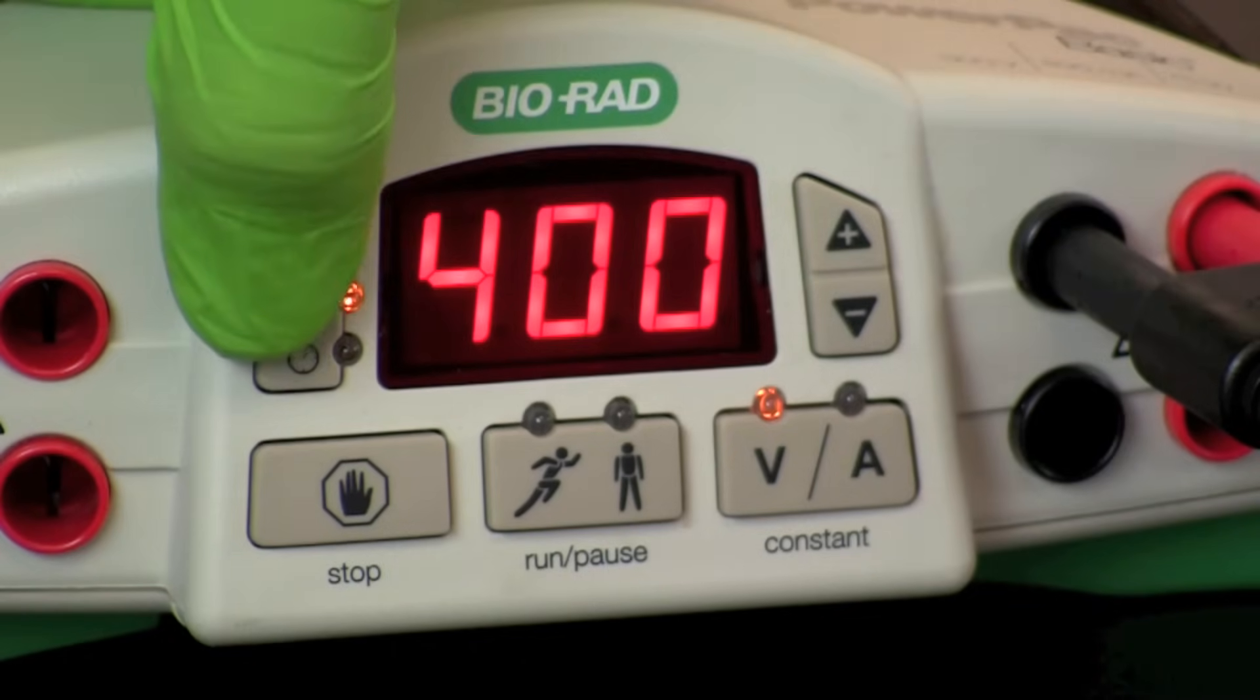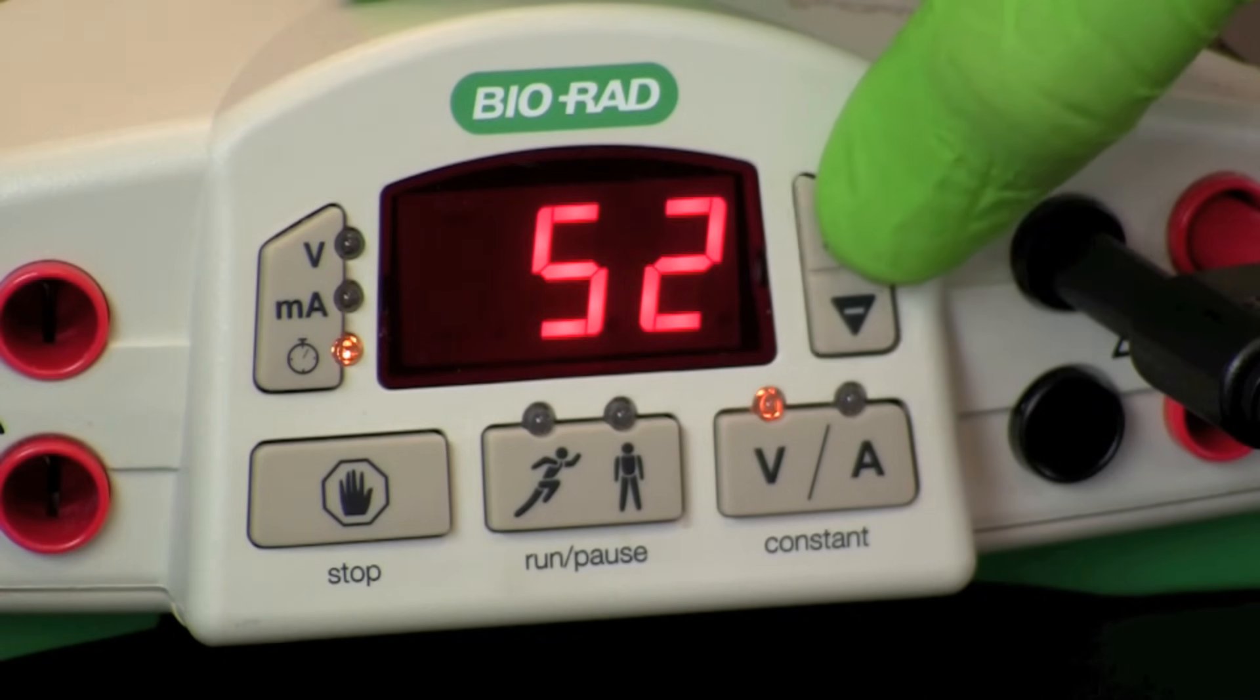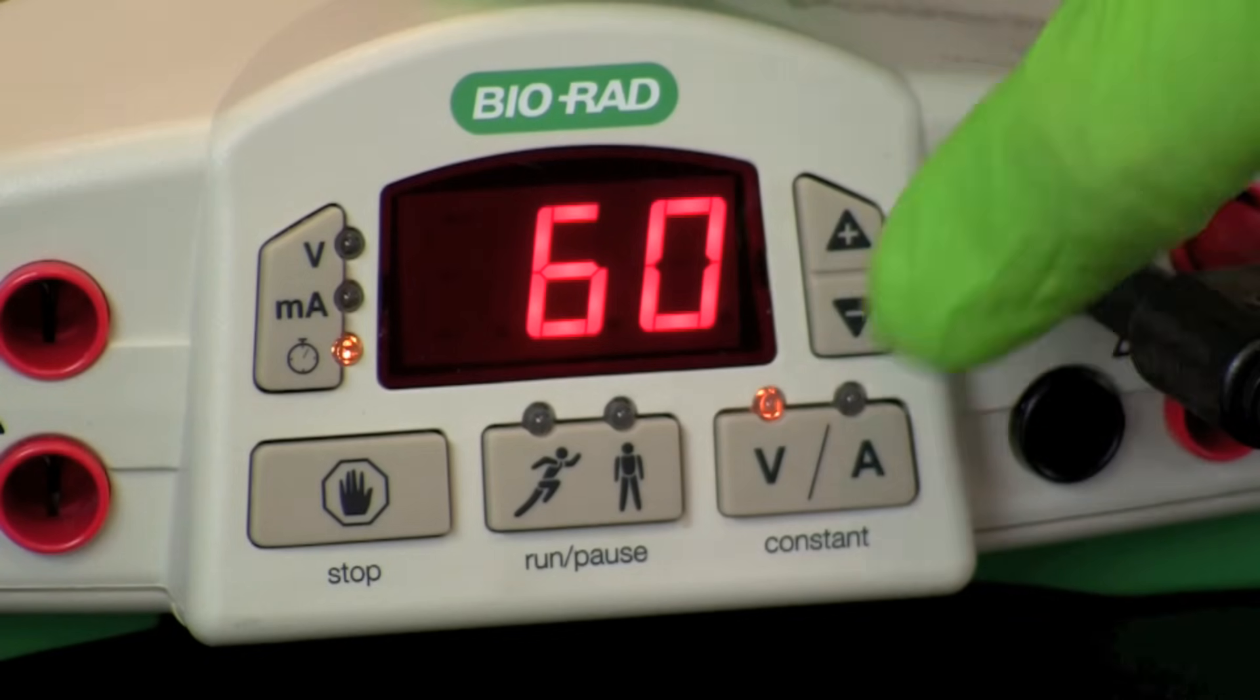If a timer is available on your power supply, set the clock for the proper time for your run. Press the start button to begin the flow of current that will separate the DNA fragments.